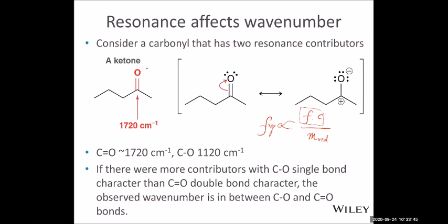And so, for example, the ketone. The ketone has resonance because the pi electron between the carbon and oxygen in the double bond can be more attracted to the high electronegativity oxygen. So the resonance contributor is a polarized carbon-oxygen single bond. Okay.